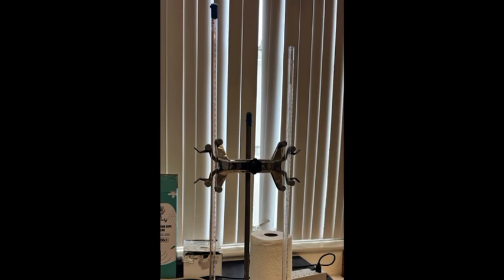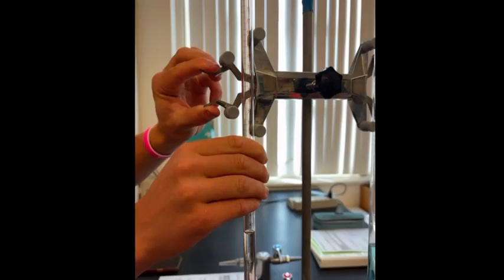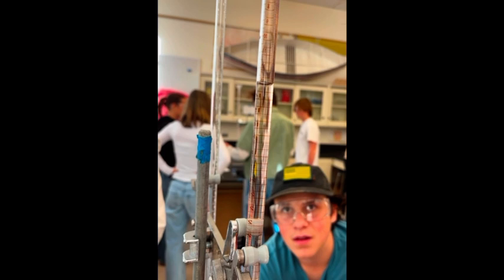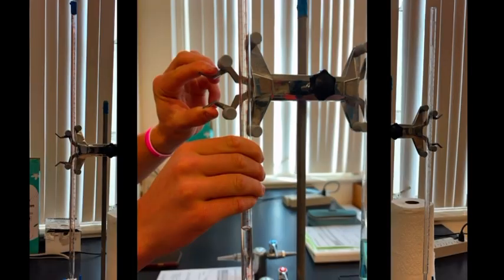In our lab, the materials that were given to us were 2 burettes, 8 test tubes, as well as solutions containing KOH and CuSO4. The burette is the one that was filled with the solutions. We filled one burette with 0.2 moles of KOH, which is a clear liquid with very similar appearance to plain water, and the other with 0.1 mole of CuSO4, which is a blue-tinted translucent liquid. The test tubes are critical to our conclusion, and are the tools that we use to contain the reaction, and the vessel that was used to hold the product.